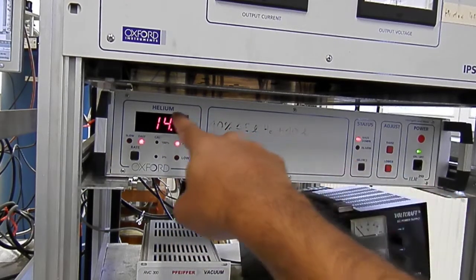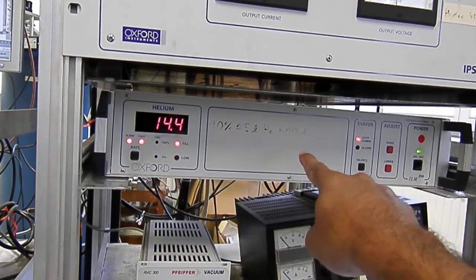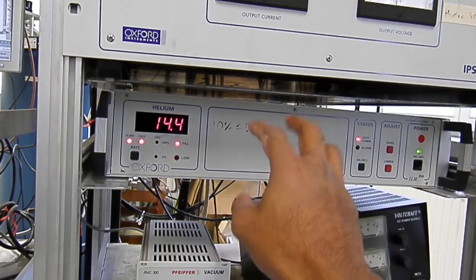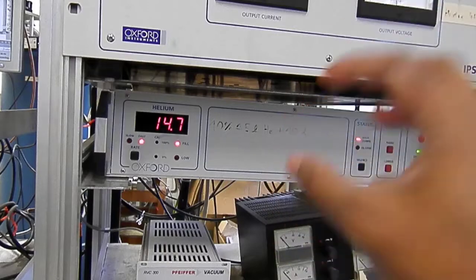This device, the helium meter in the Oxford, gives you an estimation of how much helium is inside your magnet.